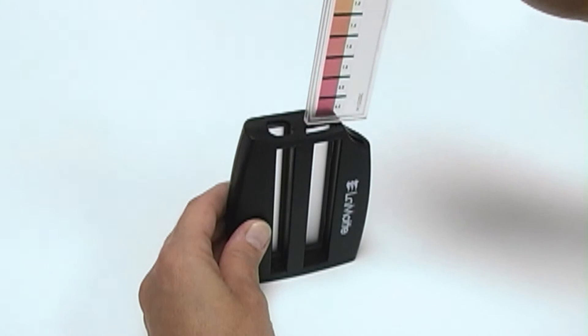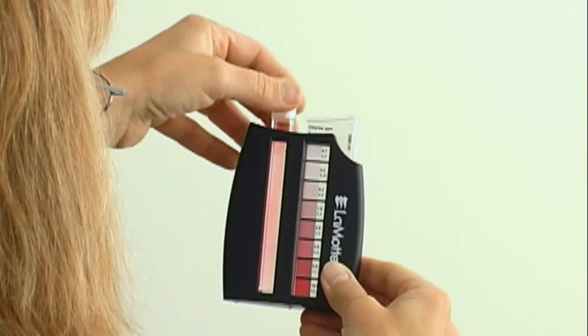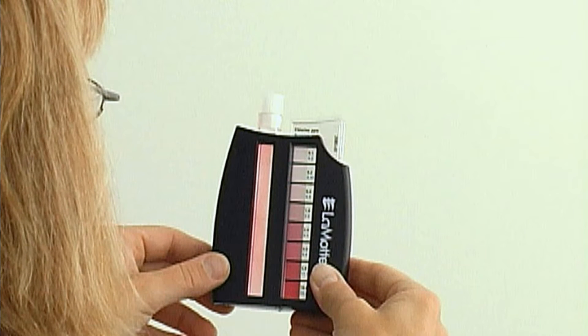Insert the color bar into the viewer. Then, insert the test tube with the reacted sample. Hold the comparator so that indirect light comes through the back of the comparator.